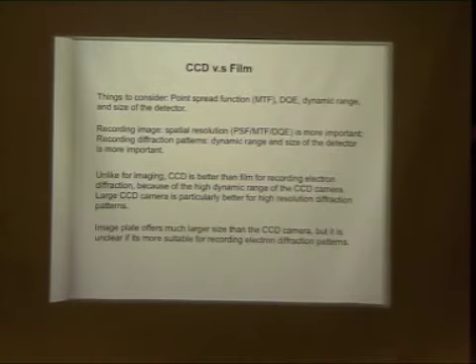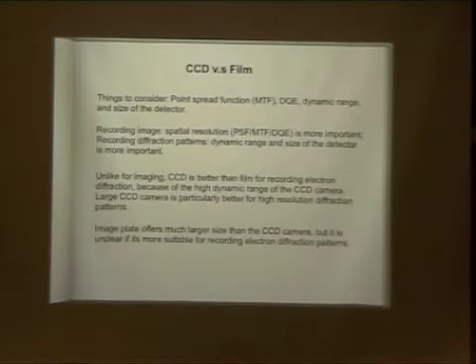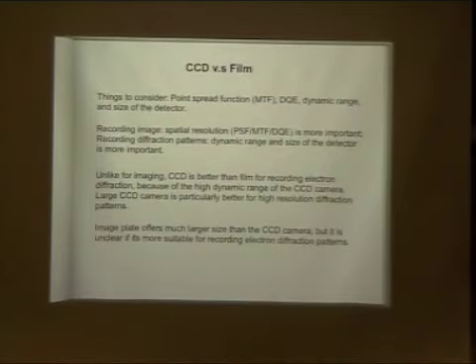But another thing I remember from when I was in Thompson: we saw trials using imaging plates for diffraction. Yeah, we did. Imaging plates are kind of interesting because you don't need a beam stop, so we thought we could measure everything from very low to very high resolution. They have an even better dynamic range than a CCD camera, and we thought we would have a larger imaging area.